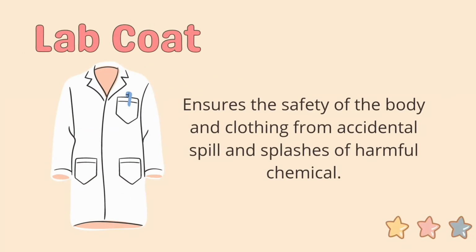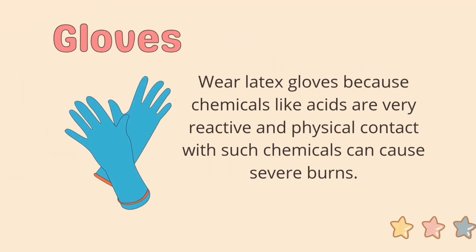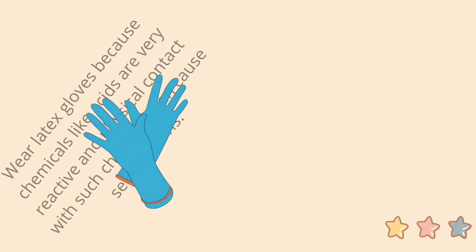And lastly, the laboratory coat. It ensures the safety of the body and clothing from accidental spills and splashes of harmful chemicals. And in the hands, we should use the latex gloves because chemicals like acids are very reactive and physical contact with such chemicals can cause severe burns.